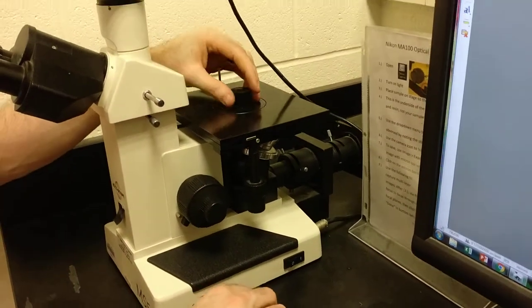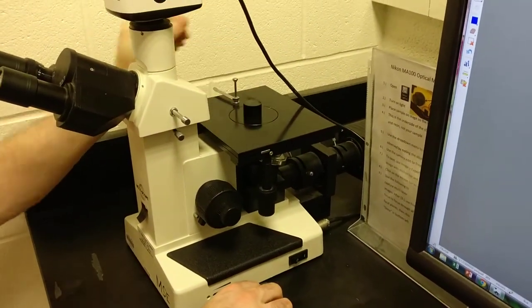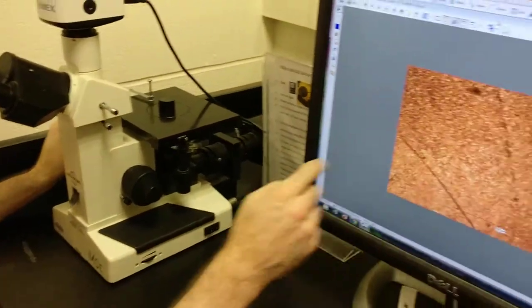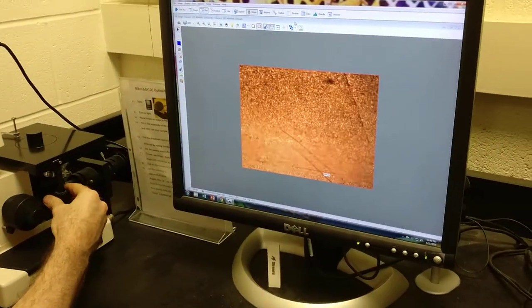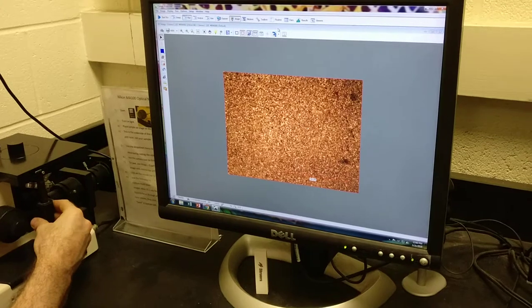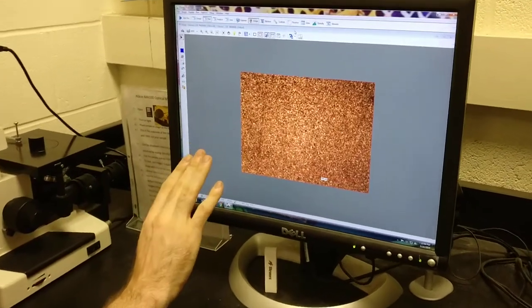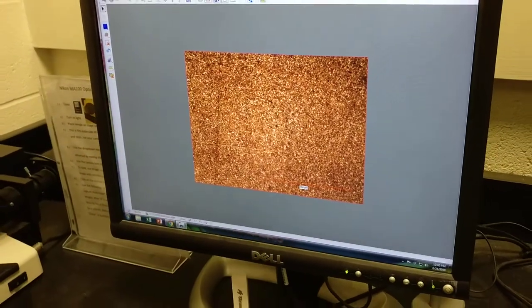So we want to make sure that the light is coming through and hitting our sample. Put it face down and check that on the screen we have something that looks like this. If we had just a polished sample, this would be mostly a light yellow, but it would be very bright all the way across.